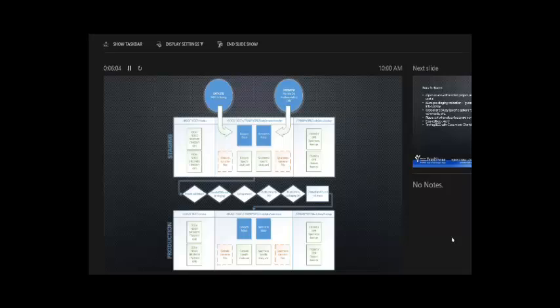One thing that Biocat does lately, which is pretty clever, is that it actually talks to the staging server after the load is made and sees what it looks like there. It asks LabKey, how many participants do you have in this study? Because LabKey develops the list of participants on the fly. It's not based on your demographics data set. If you bring in specimens and those have new PTIDs that aren't in the study already, it will add those PTIDs, and sometimes that isn't what you want to do.